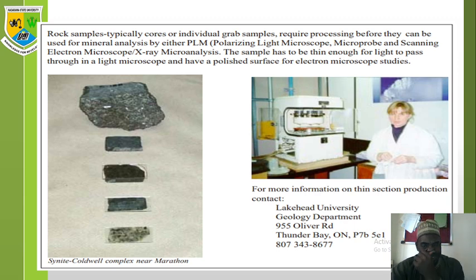For microscopic studies to be understood and for the samples or rocks to be analyzed, they have to be well prepared. Hence, this stage of preparation is essential in understanding the minerals and the rocks. Therefore, it is pertinent for a student to actually understand these procedures.